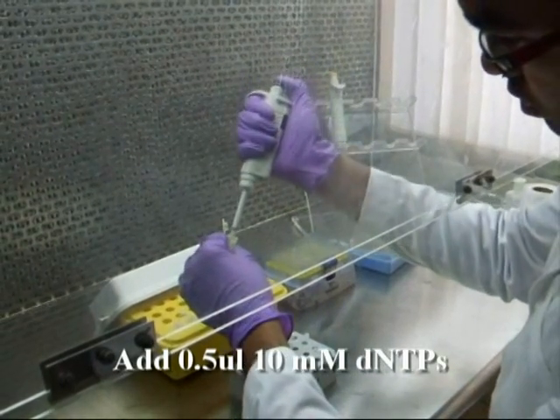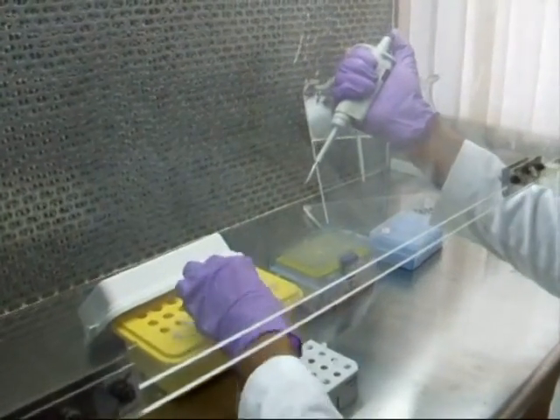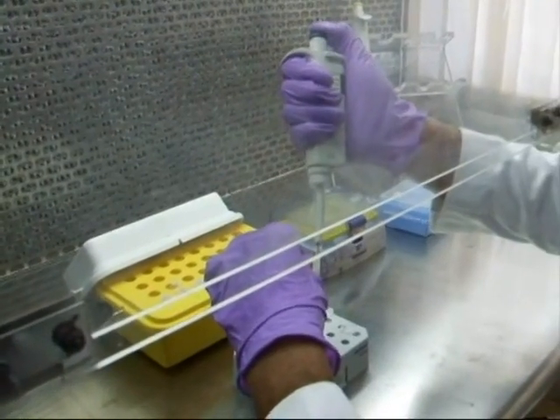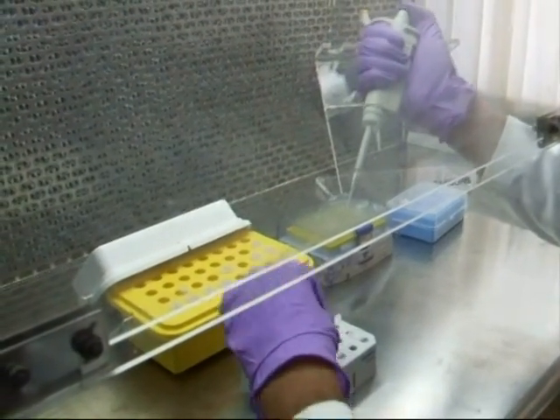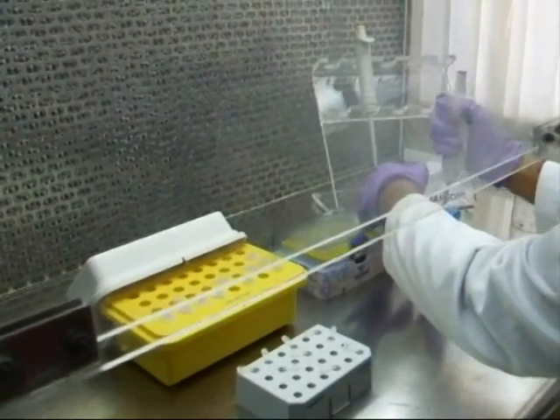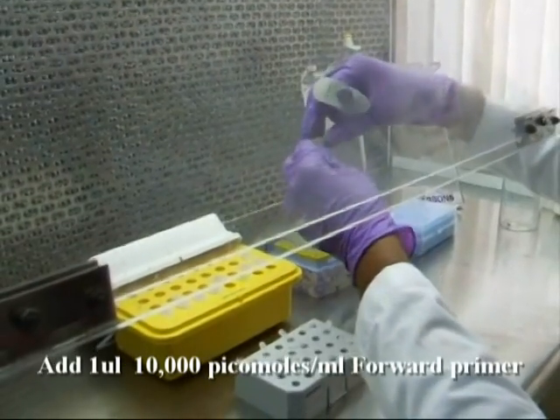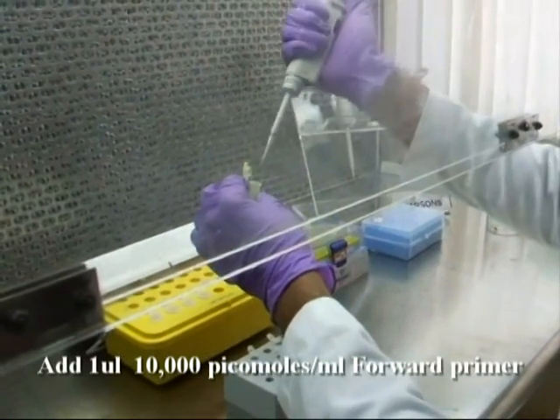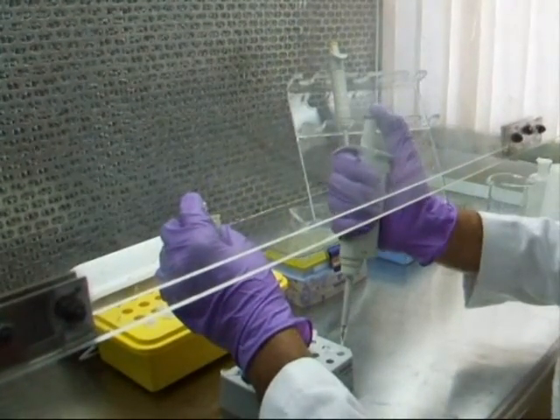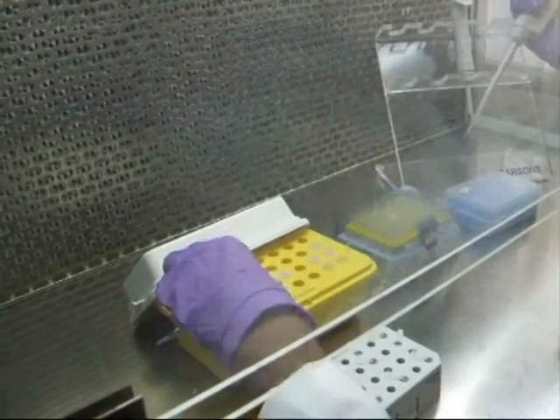Now add 0.5 microliter of 10 millimolar dNTPs. Standard reactions contain equimolar amounts of dATP, dTTP, dCTP, and dGTP. Add 1 microliter of 10,000 picomoles per milliliter forward primer. Now add 1 microliter of 10,000 picomoles per milliliter reverse primer.